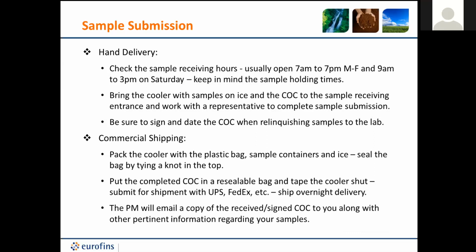And then there's another follow-up question. Does your lab have a courier service? We do have couriers. For stormwater season, it's rough for us to provide courier services because, again, everybody's sampling at the same time, and our bastion of couriers is fairly small, 3 to 5 people that we have running around from basically Santa Barbara to San Diego. So it's hard to get to everybody.